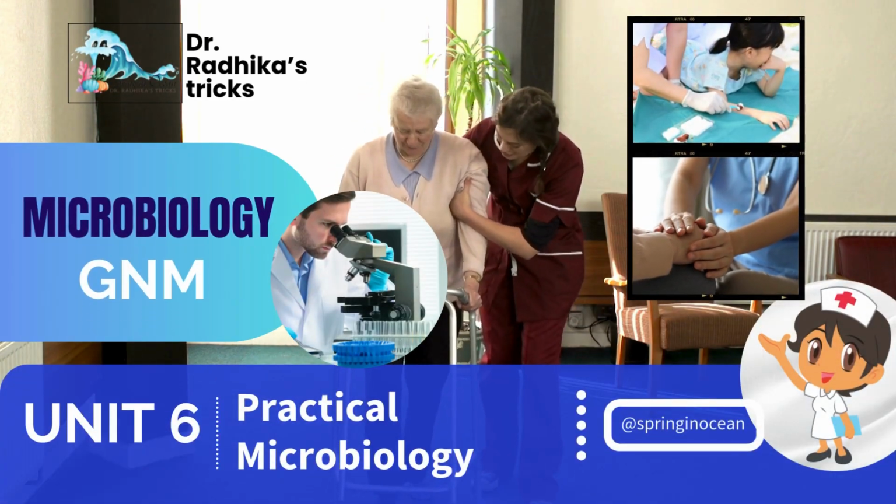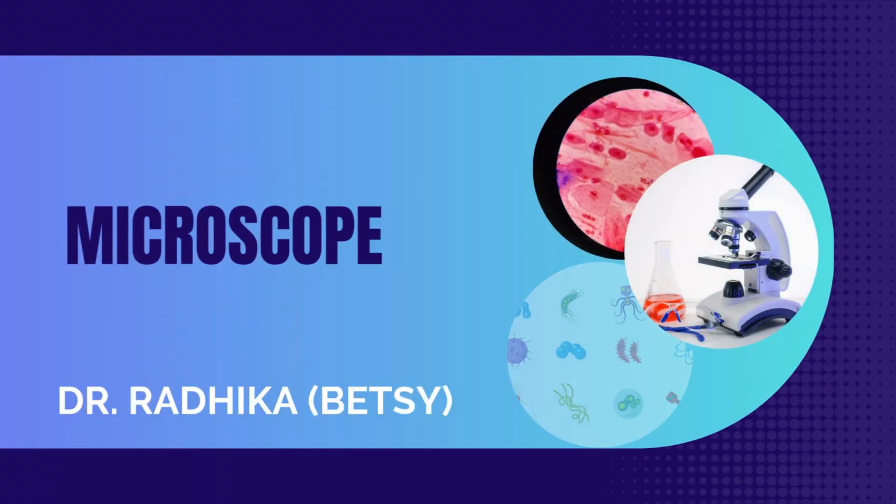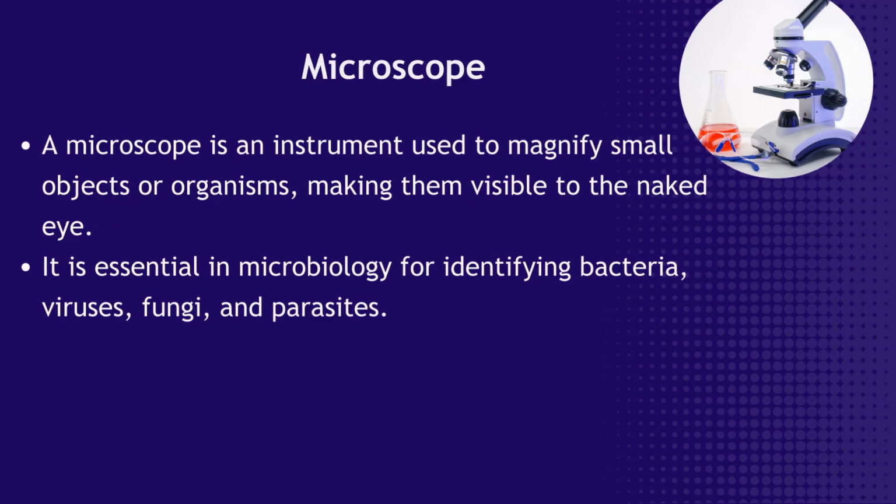Microbiology for GNM, Unit 6, Practical Microbiology: Microscope. A microscope is an instrument used to magnify small objects or organisms, making them visible to the naked eye. It is essential in microbiology for identifying bacteria, viruses, fungi, and parasites.